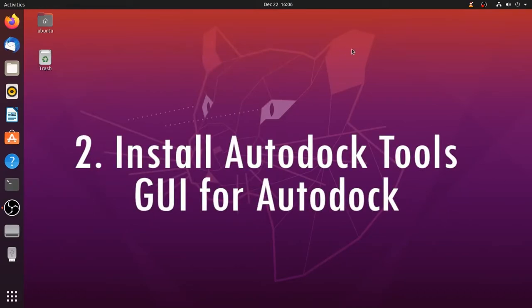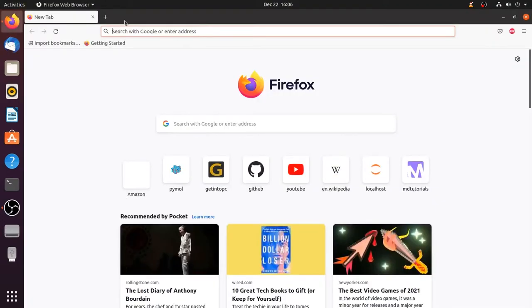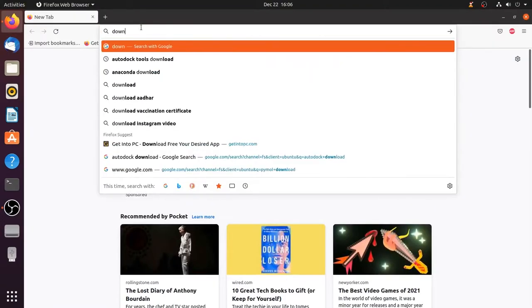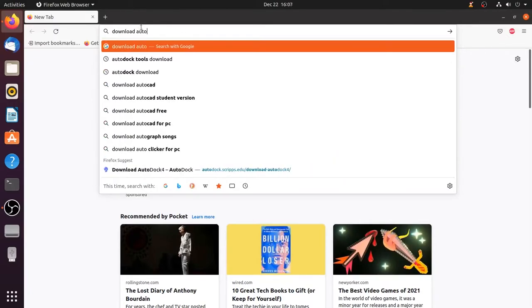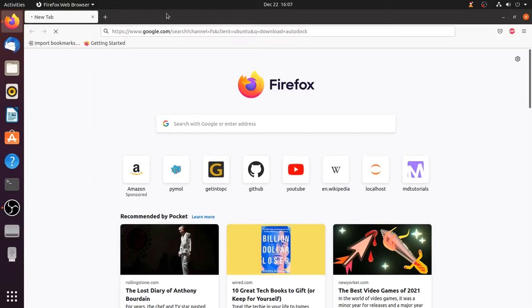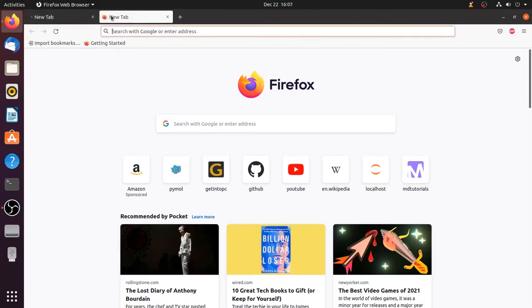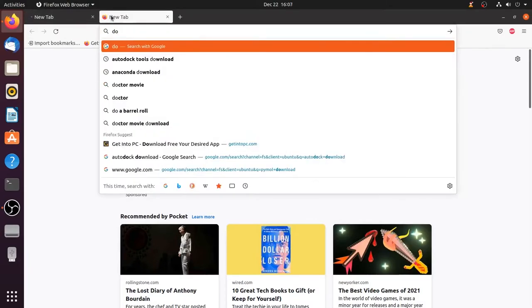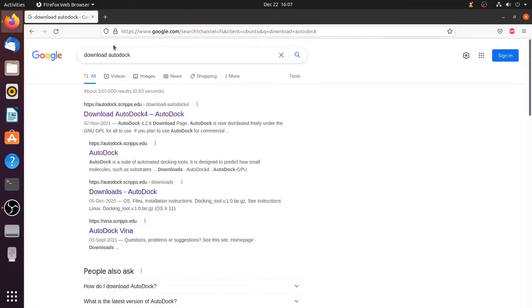Next we have to install Autodock Tools or MGL Tools which is the GUI for Autodock and Autogrid. To install this go to the web browser and search for download Autodock. Make sure you are connected to the internet.